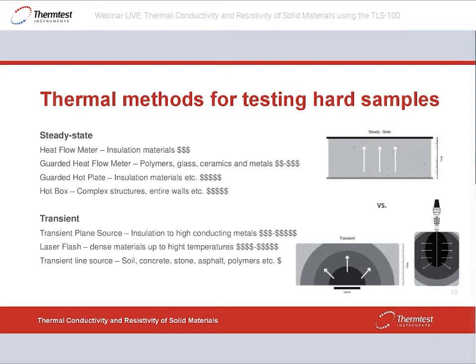These test thermoconductivity in a single direction under steady state conditions. So they require comparatively large samples most of the time. It takes time to do the testing, and it's certainly not portable. So these are in-lab for very careful and accurate research.